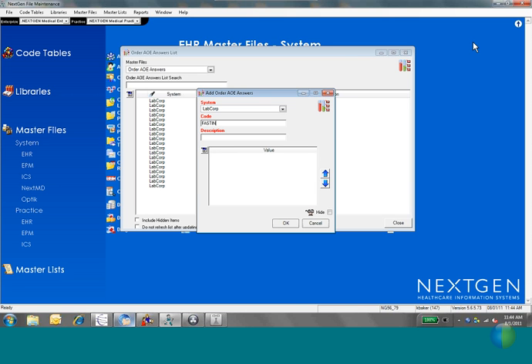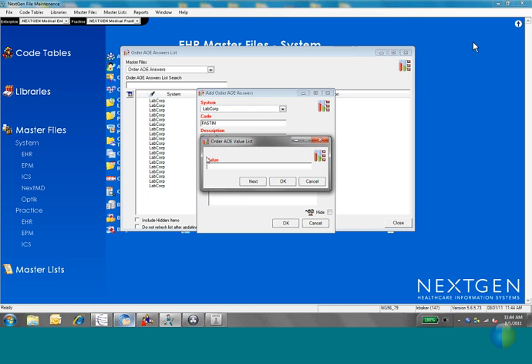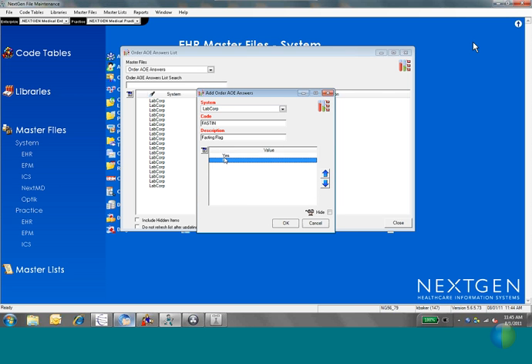So if we're talking fasting, that's what we needed here. Then this little Norton button is how we're going to create our pick list entries. So when I click new, it's going to give me a value box, and I'm going to type yes. And then maybe I'll do next, so I can click no. And that's probably all I need is just yes and no. So I create my list that way.